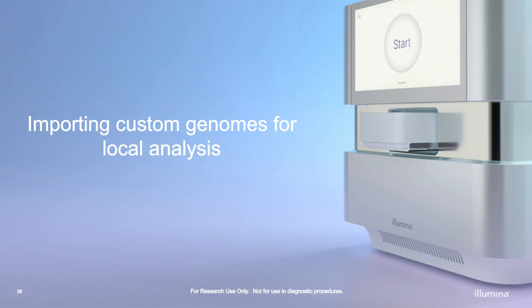Okay, so now that we understand how to build a custom genome, let's talk about using that custom genome for local analysis. So in this situation, you built your genome on BaseSpace using that free app, and now you're going to take that genome and put it into the instrument for local DRAGEN analysis.